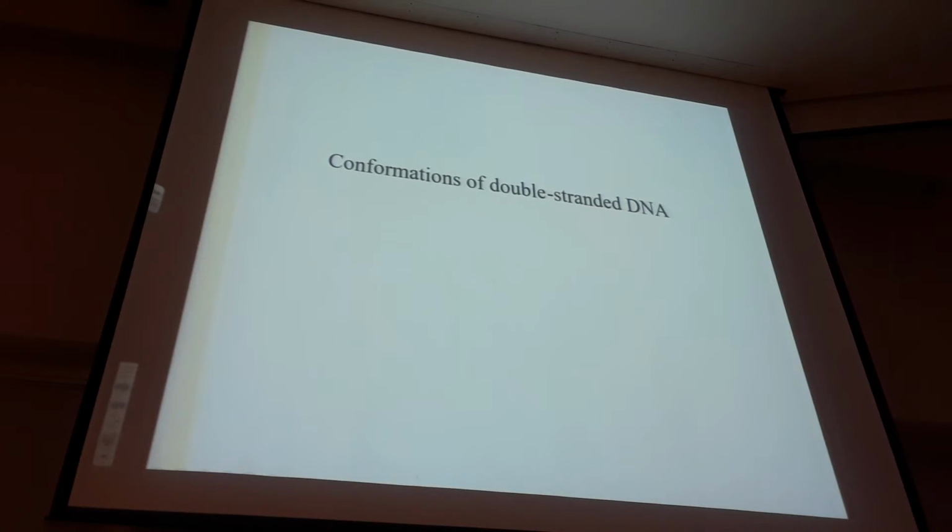try to decrease the solubility of the biological macromolecule in a certain solvent. Okay? And you can decrease the solubility by adding salts, organic solvents, and things like this. And nowadays there are so-called kits that you can go through, that give you pre-mixed solutions that contain all kinds of salts, for example. But in the early days, okay, they just had to come up with stuff and mix these solutions and then set up their samples in a certain environment.